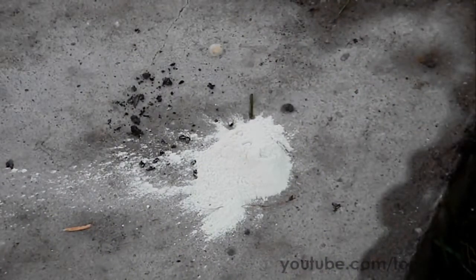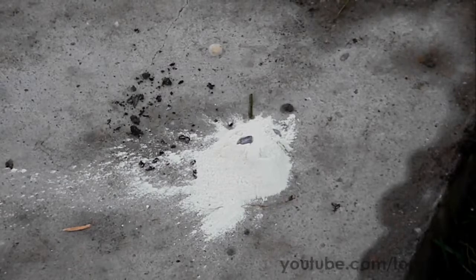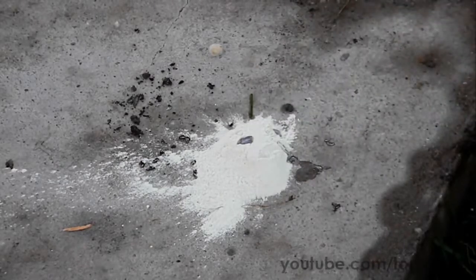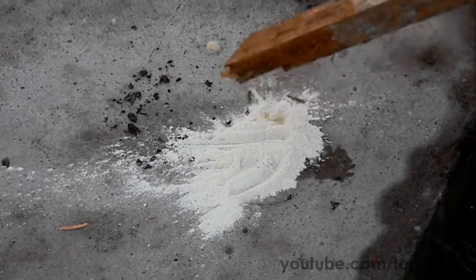Next, the reaction of sodium and sulfur. I have poured a little bit of sulfur on the stove and now I'm adding the pieces of sodium. To start the reaction you must moisten the sodium — for this I have used a wet piece of stick.